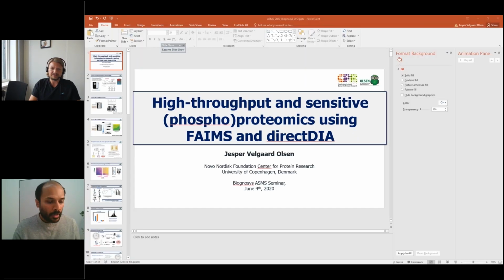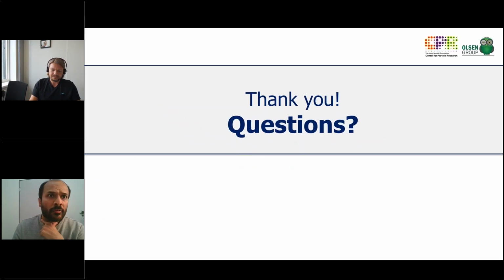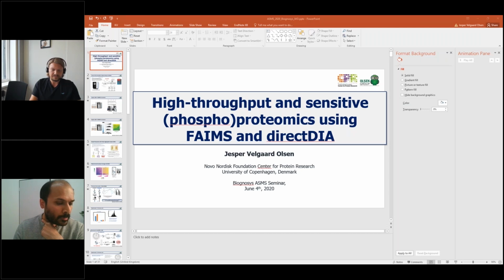Okay, yeah. Nice. Then I think we have some questions about just how to set up or how to select CV. So I know in our hands, the tipping point for using multiple CVs has been around 1 hour. I'm not sure if that's also what you find in your experience with your setup, but in general, that's also what we previously saw, at least.